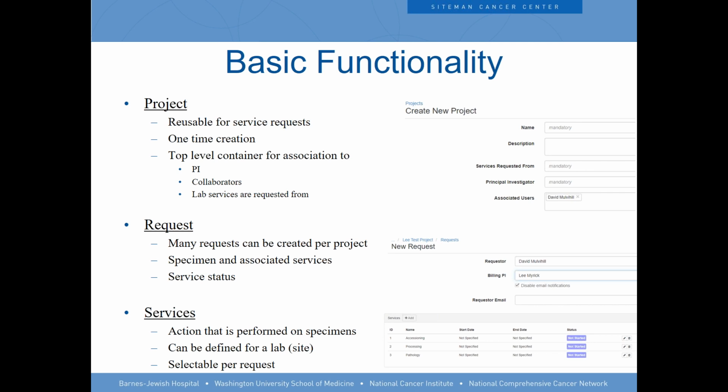Does OpenSpecimen have an auditing feature to perform governance of audits, etc.? So yes, 100% of the data or the operations that you do in OpenSpecimen is audited to the extent that it tracks where it was done, what was the old value, what is the new value, the IP address of the person who has done it, etc.